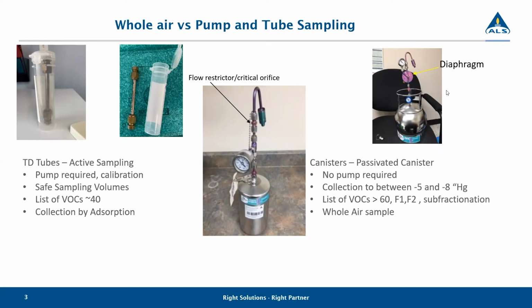But the best analogy I can think of is if you're taking a water sample, unpreserved water, and you're putting that into a Gen Chem jar. We always let our clients know that you need to fill it at least to the neck. So whether you fill it to just below the neck or just above, it would be rare that we would say we don't have enough sample, because we're just taking an aliquot out of there. Now, if you only fill that water container half, we may call you and say, look, we're going to have to do a dilution because we don't have enough volume of sample. So air is exactly the same. If we don't get that canister filled enough, then we may have to do a dilution because there's not enough sample in there. So that's sort of the best analogy.